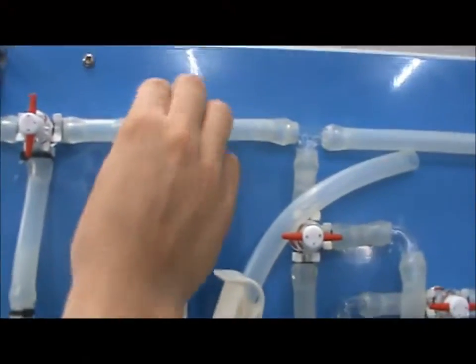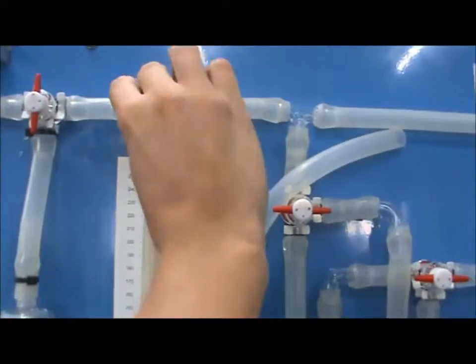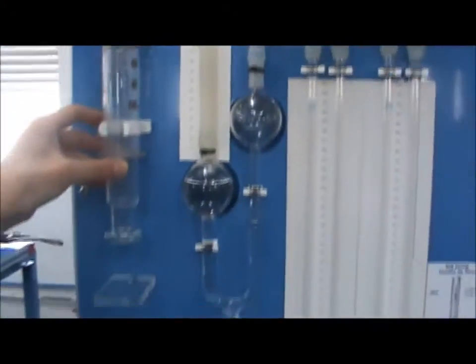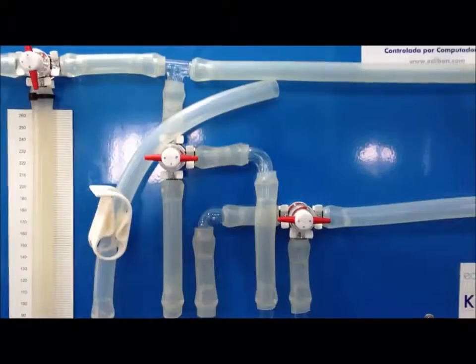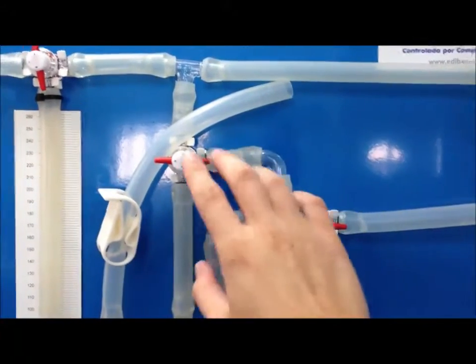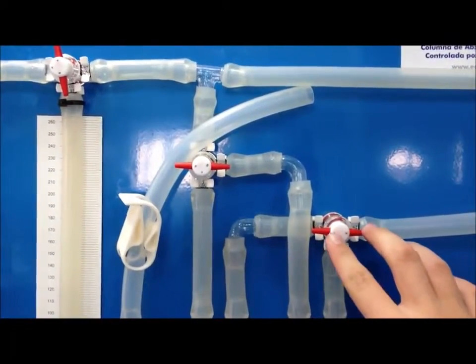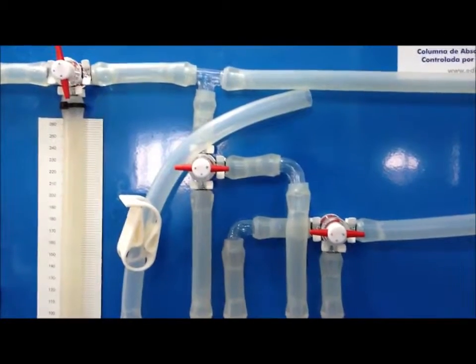To keep this level fixed, close both VT2 and V1, isolating this portion of the line. Ensure that valves VT5 and VT4 are closed, as we will not be using this portion of the unit.